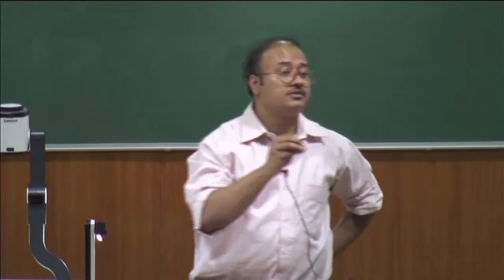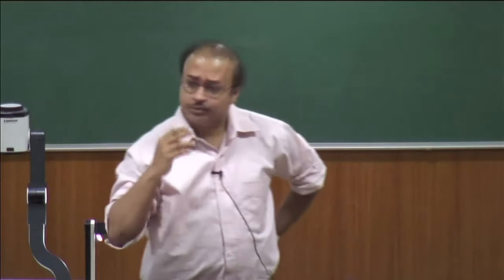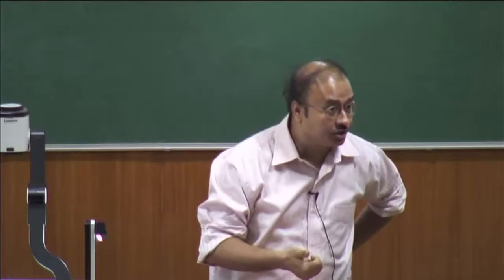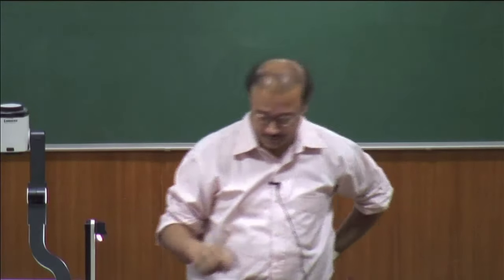So, this is the principle behind a double beam spectrophotometer. Now, you think about this, if you would do it with a single beam, you would not have this luxury. That is why double beams are so very frequently used nowadays.